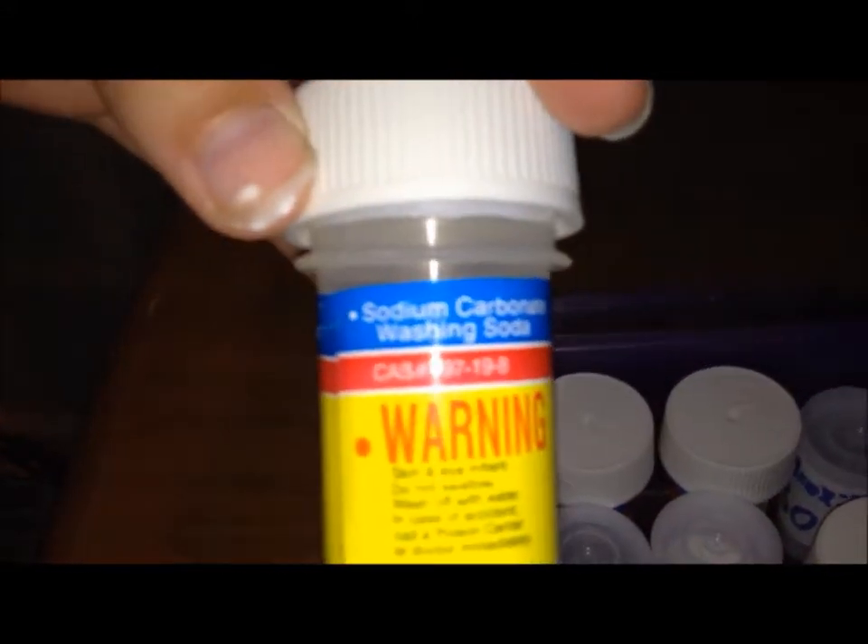We've got sodium hydroxide — I've got a lot more of that kept on the shelf. I've got tartaric acid which I use to make Fehling's solution. I've got calcium carbonate, which is limestone. And finally sodium carbonate, which is washing soda.